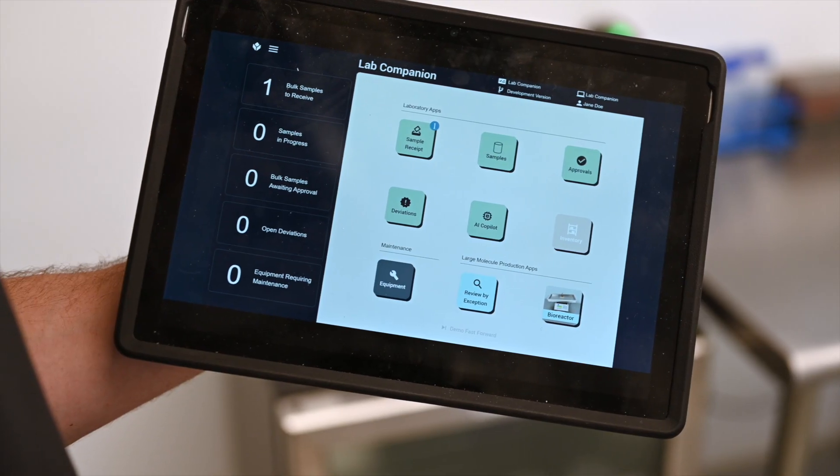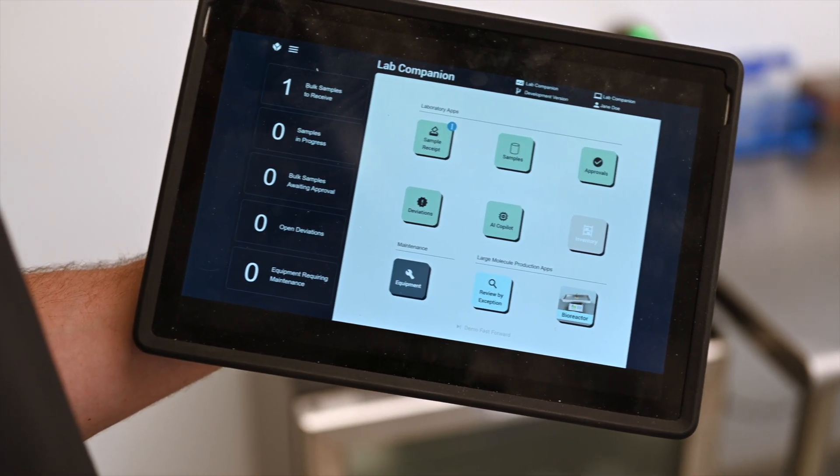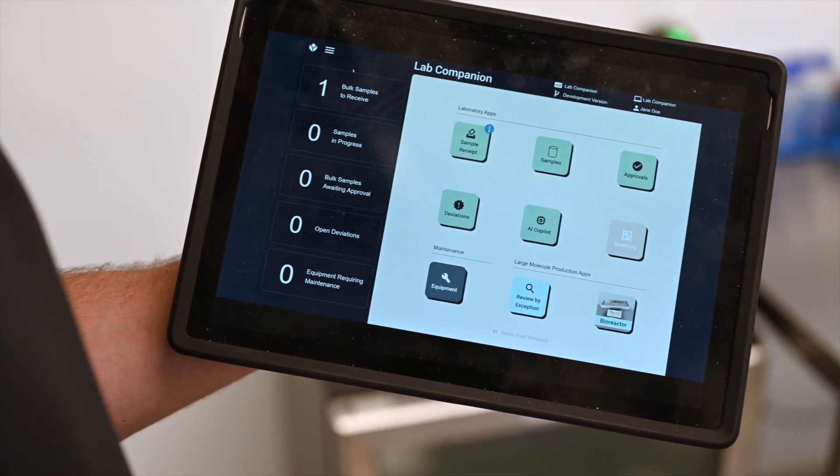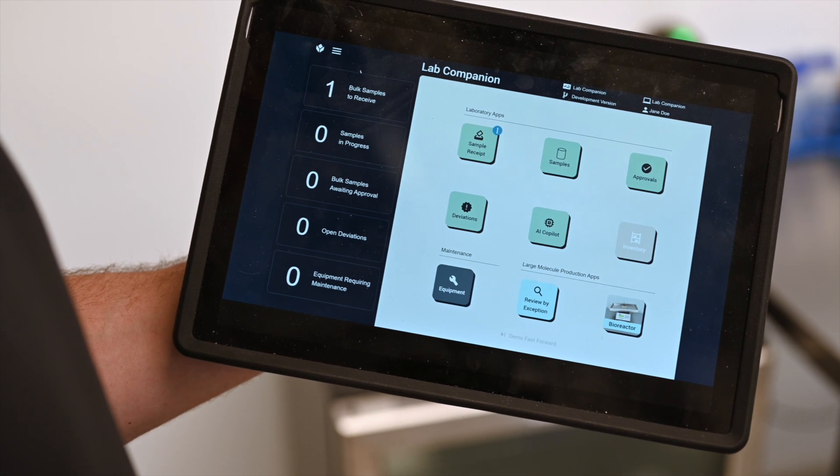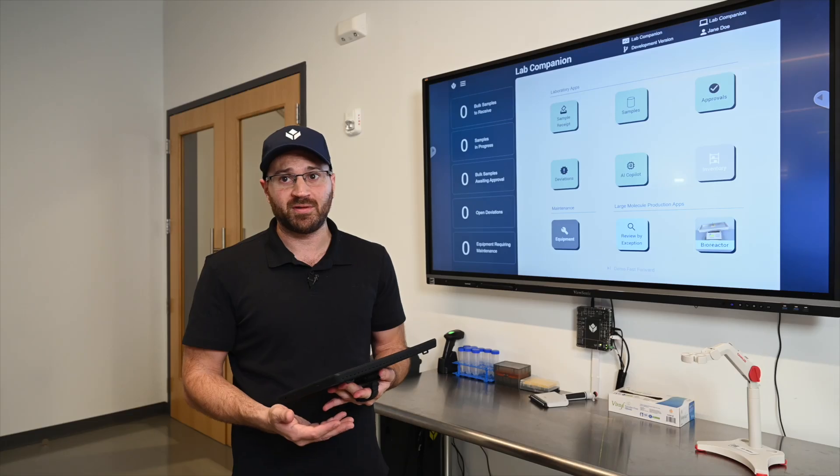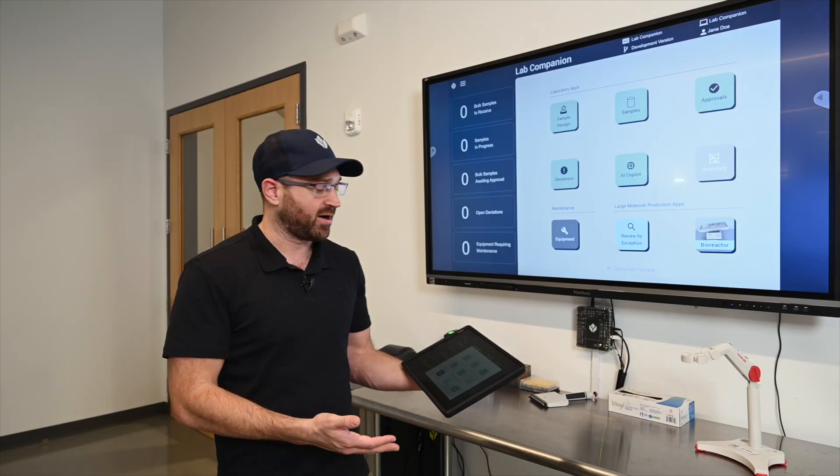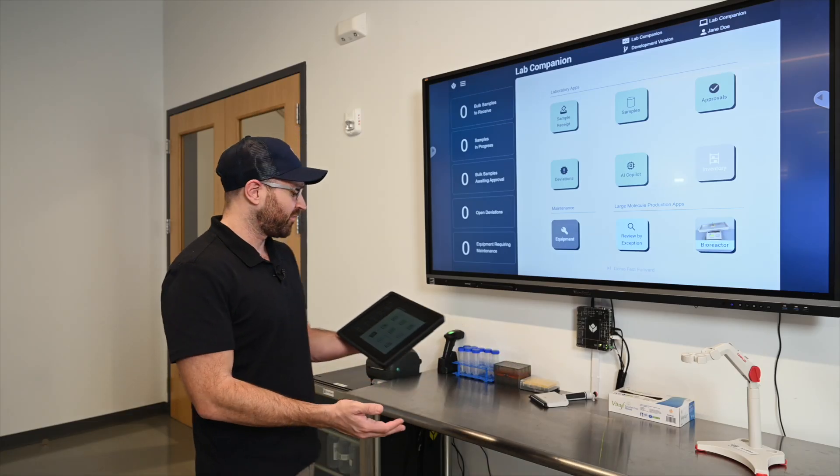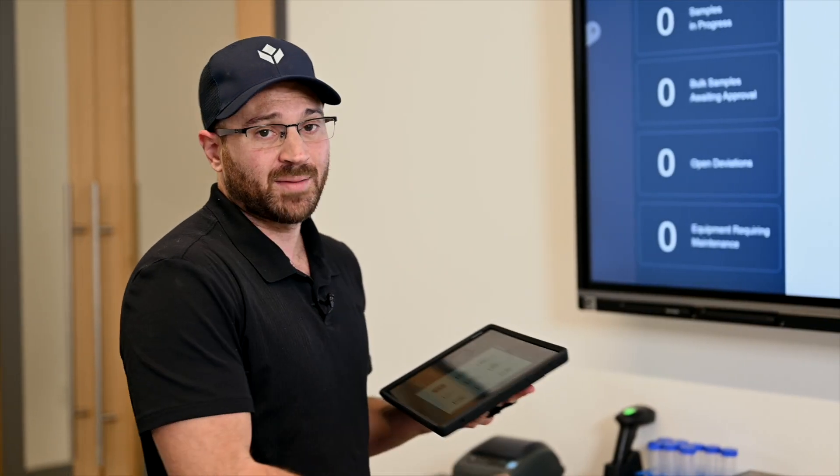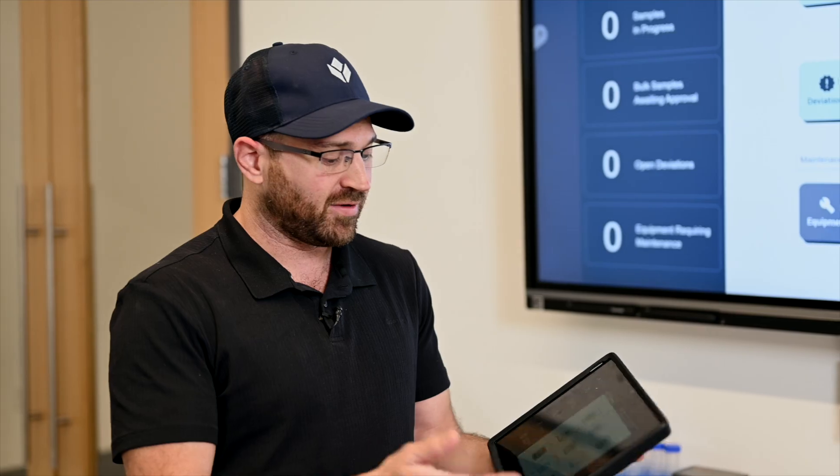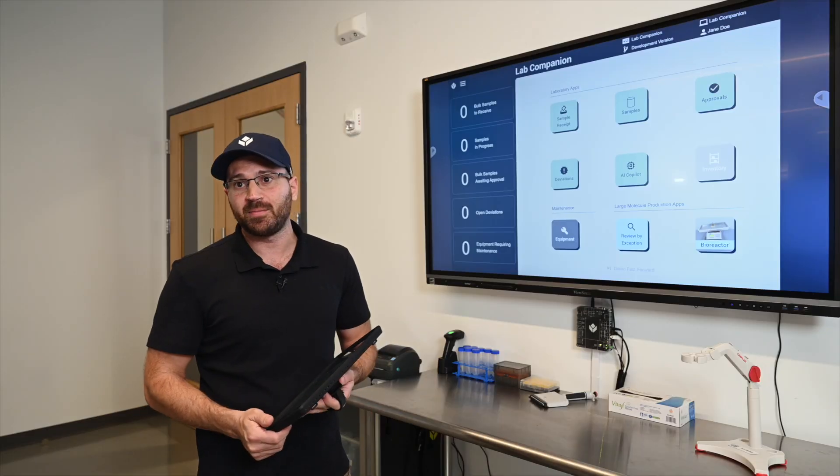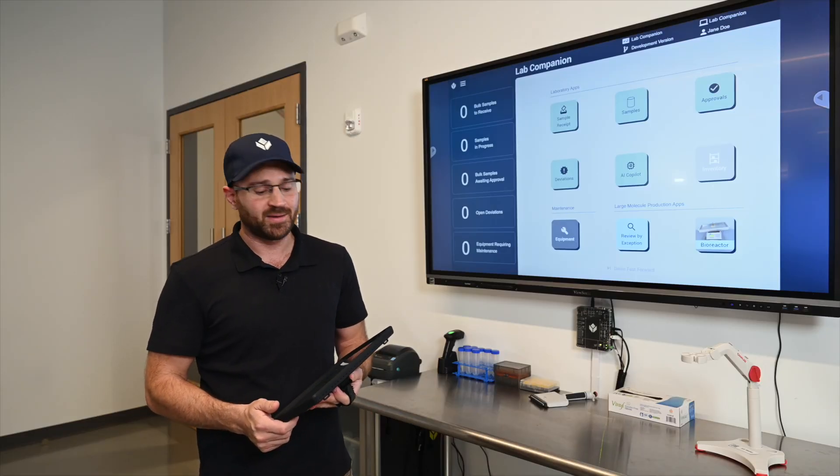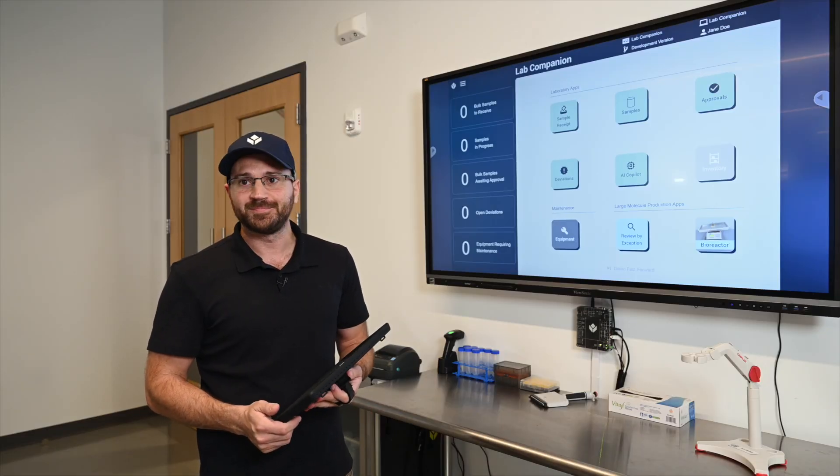So we've just shown you an application built for laboratory operations. It shows how different personnel within the lab can perform tasks that are related to their workflows. For example, sample receipt, sample management, sample testing, approval, as well as equipment maintenance, and even showcasing some frontline copilot within a laboratory setting. Thank you.